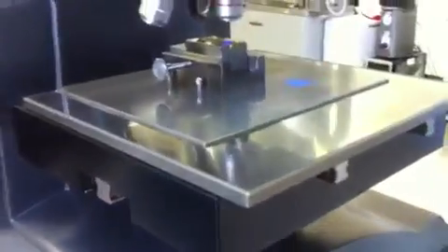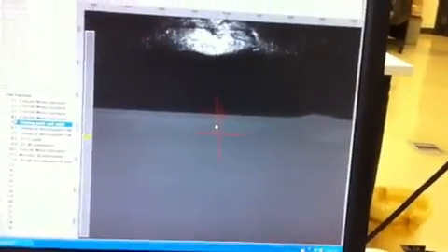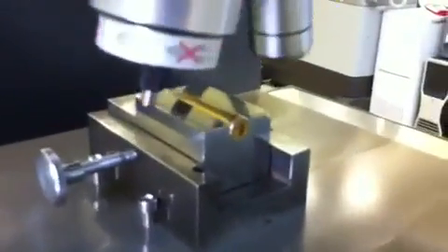There's a camera mounted inside of our frame, and we can navigate using our XY table. We can navigate any which way we'd like, and we can quickly and easily define our starting location. We'll navigate to that point. I can press the spacebar on the keyboard, and I now get a crosshair. The user can now just press enter.